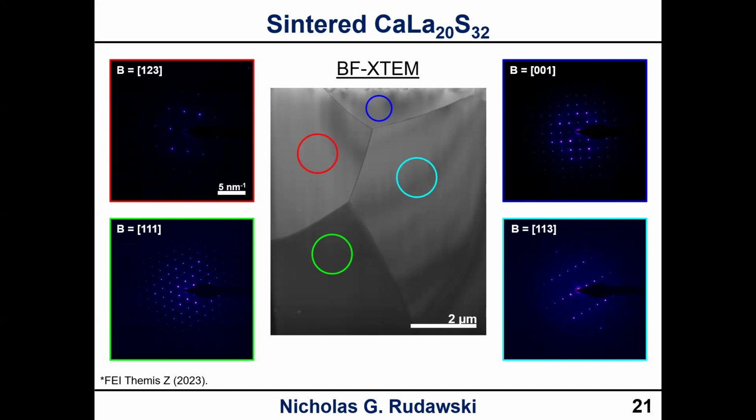Okay, so this is a way using diffraction to characterize grain boundaries, if you will. At least at a coarser scale, right? This is obviously not an atomic level characterization, but this is a coarse orientation characterization. Okay, what zone axis, what planes? We can do this with diffraction.